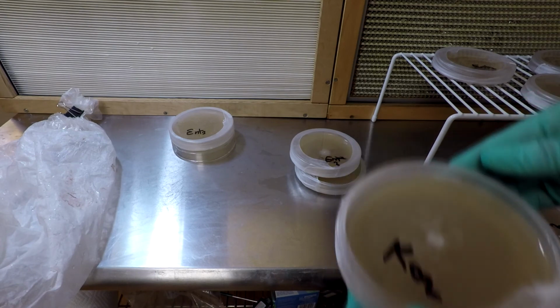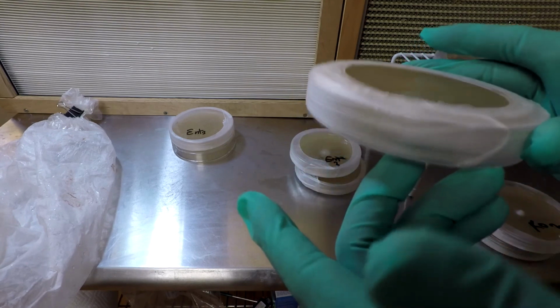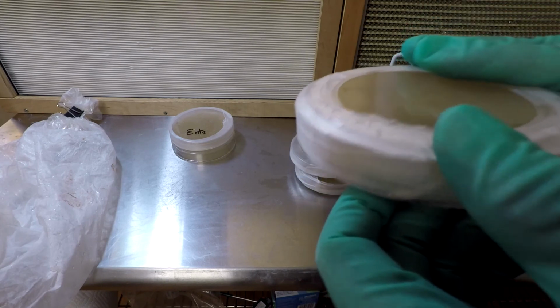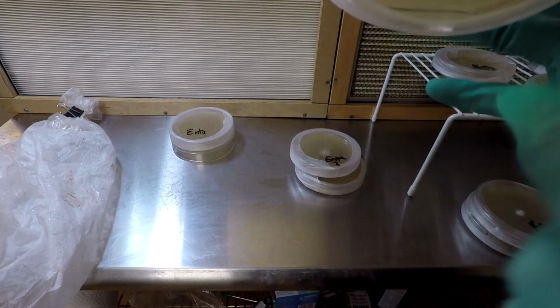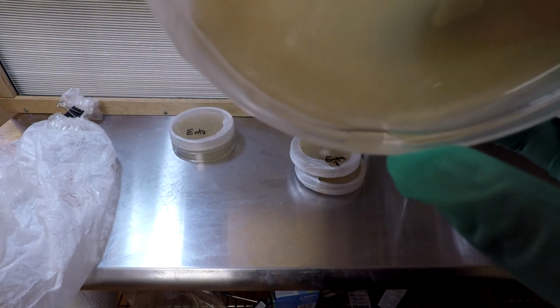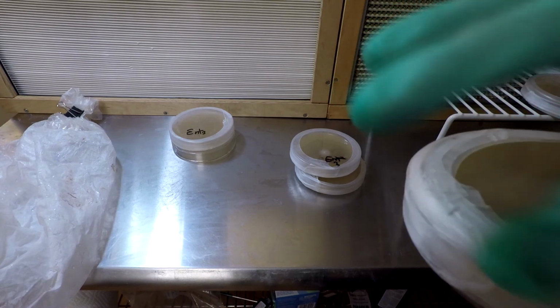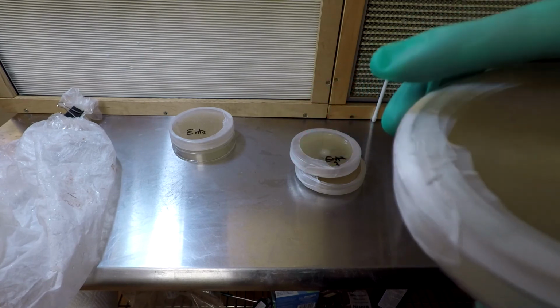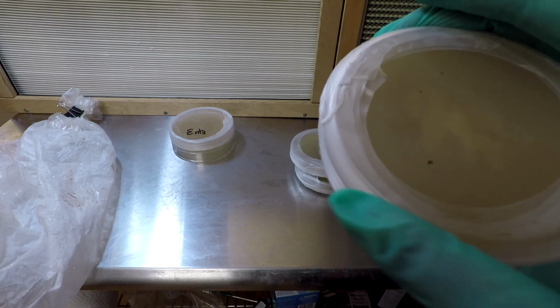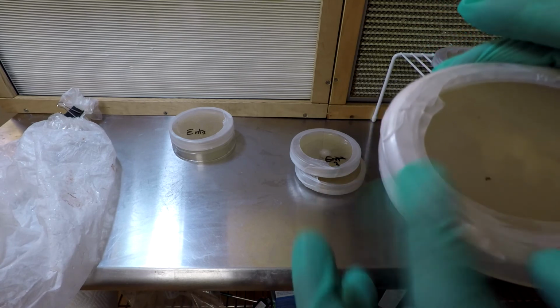I tried the suggestion of storing the dishes upside down like this. I don't recommend that anymore. Or I never really recommended it, but it's not a good idea from what I've tested. Because what happens is, see that pool of condensation in there? You're always going to get some condensation. And when you flip the dish over, it's going to kind of roll underneath the bottom dish rim and get into the space between them. And then, you know, that's where my thumb and fingers have been and stuff.